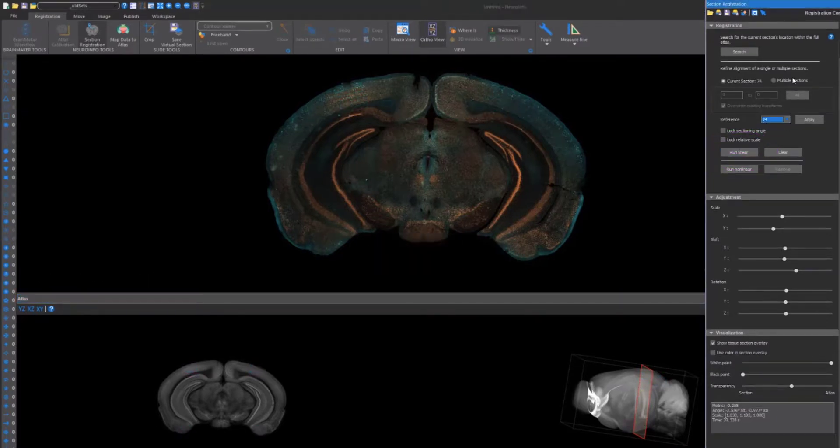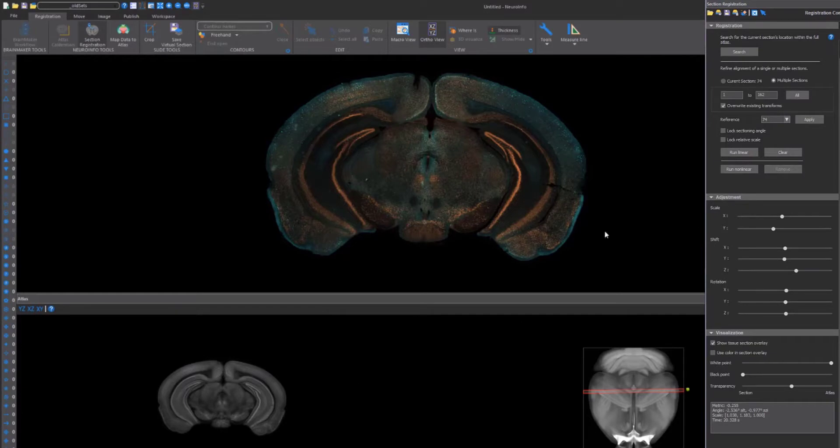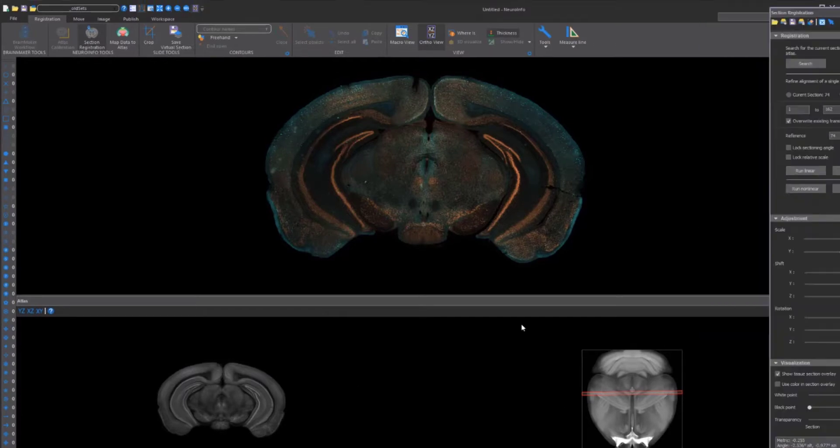After you have an accurate fit, make it the reference, save all the sections, click Run Linear, and save the transforms to a folder. Then, click Map Data to Atlas.